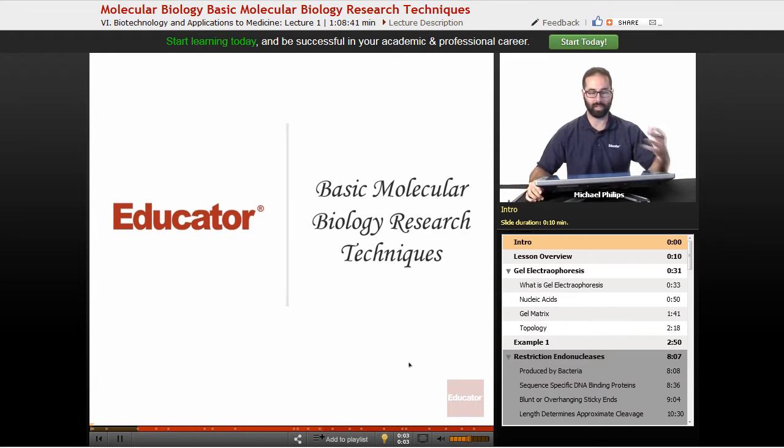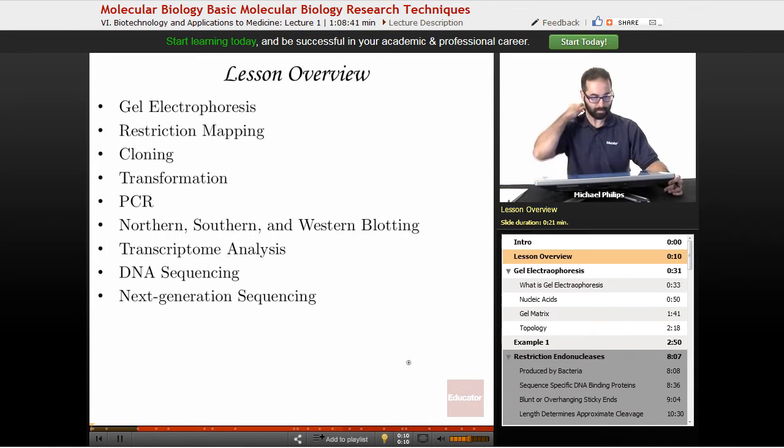Today's lesson is going to be on the basic molecular biology research techniques that you'll probably come across in your lab session. So as an overview, we first have to talk about gel electrophoresis, because that's often going to be used for many different purposes for analyzing results. From there, we'll talk about restriction mapping, going all the way through to DNA sequencing.